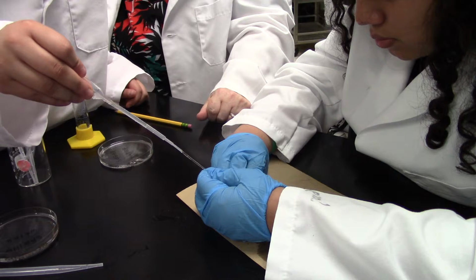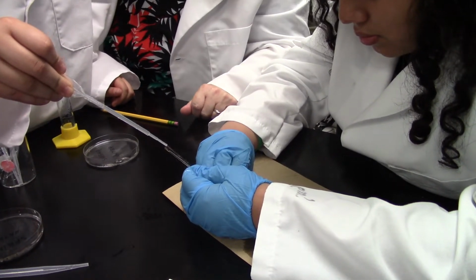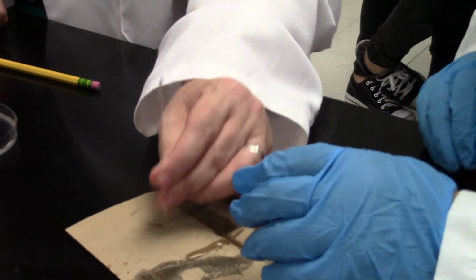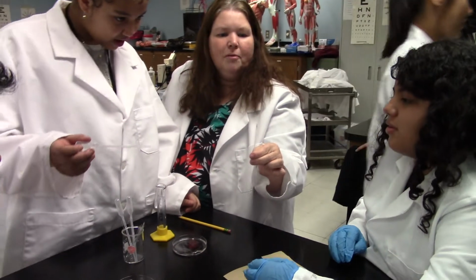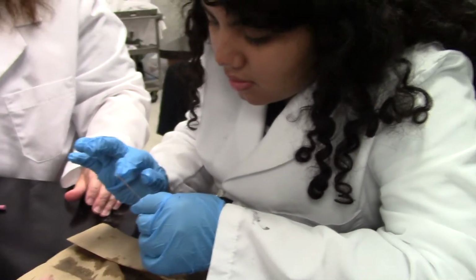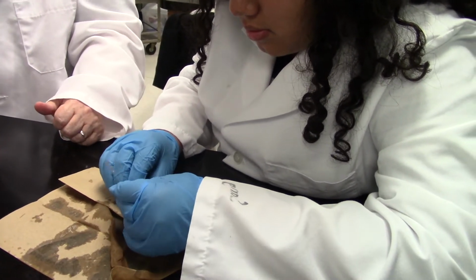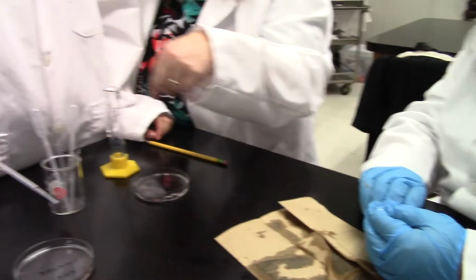He's there. Oh, he's hanging out. That's okay. Get him in there. Come on, little wormy. Get in there. Oh my God, half of him's hanging out. Oh yeah, she's got worm. Get him some air on the other side of the tube. There we go. Oh yeah, tap, tap, tap. Make him come down a little bit. Get him on the other. Okay. Woo, you're worm wrangling. Leave one of those real thin ones for spring water, and then the others will be the sugar.